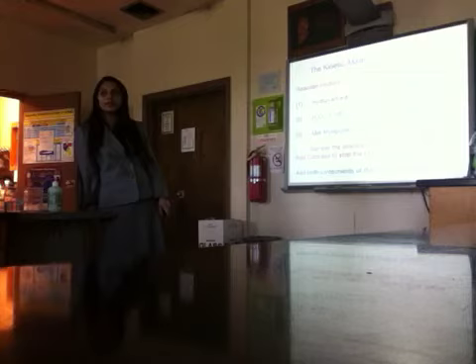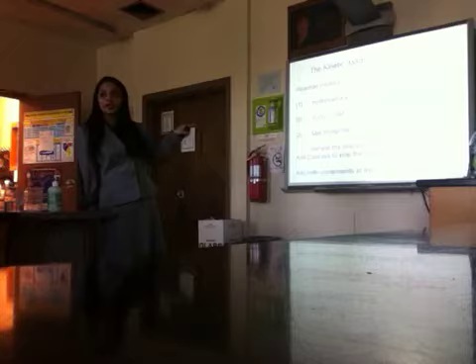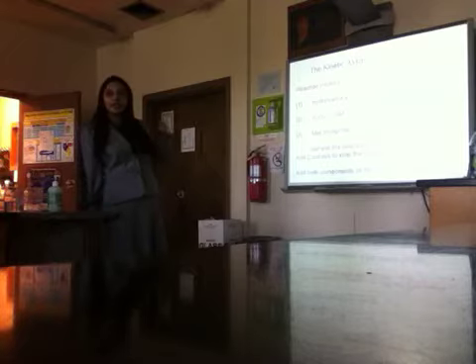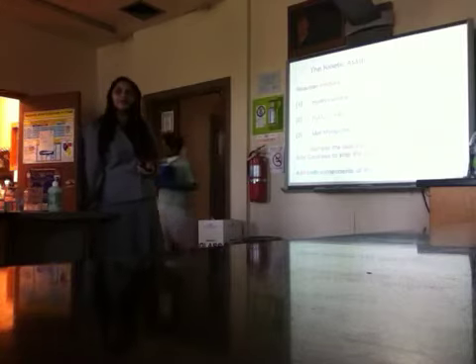Maybe, maybe not. What was different between the two instruments? The diode array has a path length of 10 millimeters, and I'm using the NanoDrop spectrophotometer, which has a path length of 1 millimeter. So it's a factor of 10 difference.